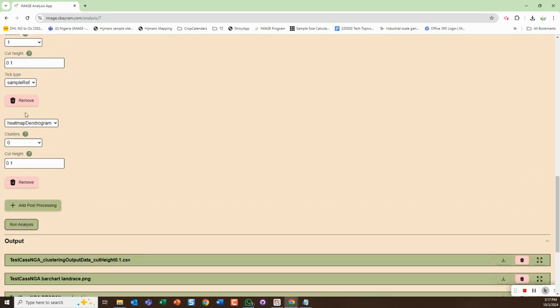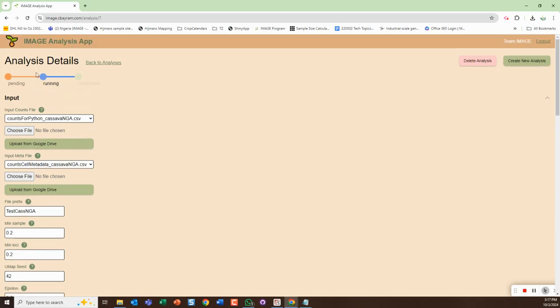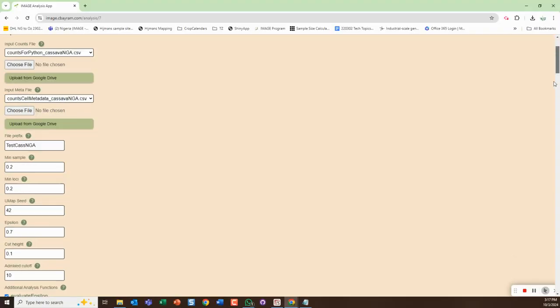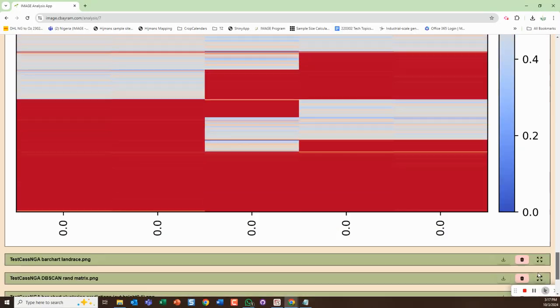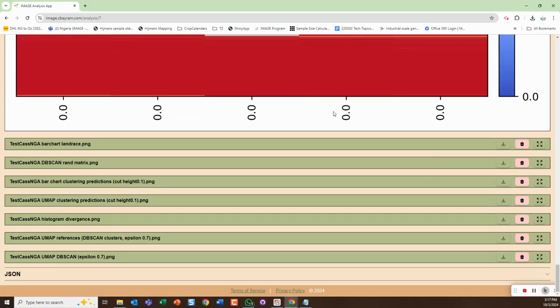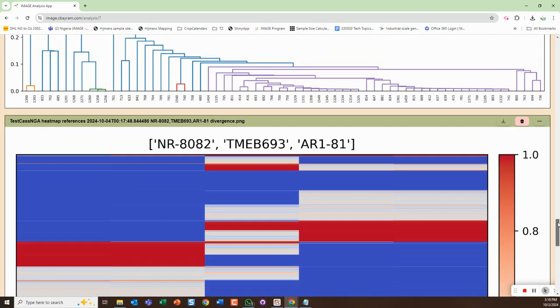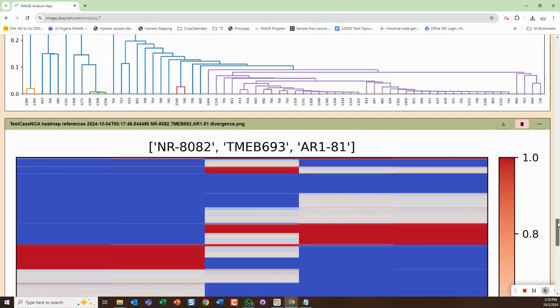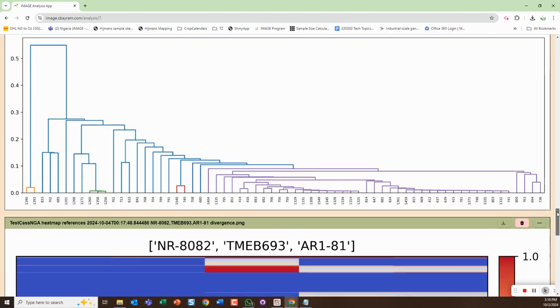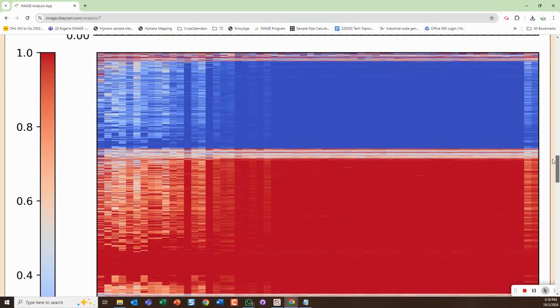Then I can run this analysis. I could keep adding post processing as was of interest. So it's going to run that analysis here. It also shows you I believe up top that it's running. We'll see how long it takes to complete. It's completed.